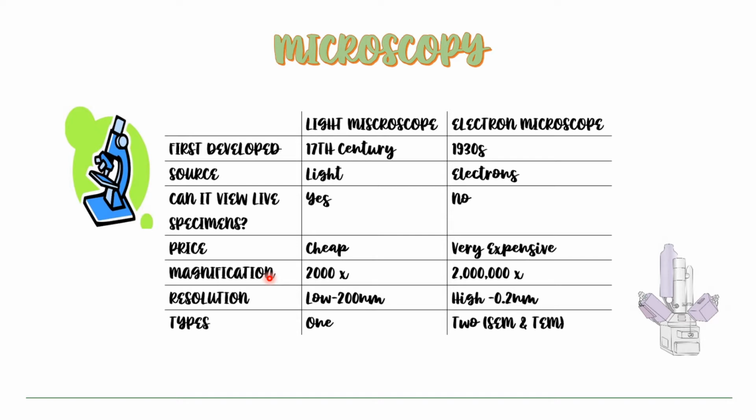We have already learned a lot about the cell and its organelles, but it's important to know how the cell was discovered as well. So in today's topic, we will be learning about the device which was used to discover the cell. Yes, we are going to look at two types of microscopes, as you need to understand how microscopy has developed and the differences between these two.